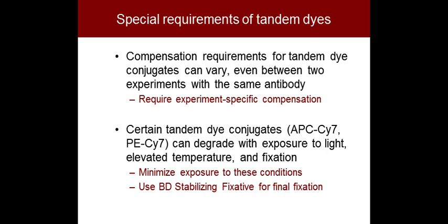And the first point applies to most all of the tandems. Their compensation requirements can vary between different lots of the same antibody, and even the same antibody when stored over time can change a bit. Now, that still is not equally true of all tandems, and the Cy7 tandems tend to be the worst.